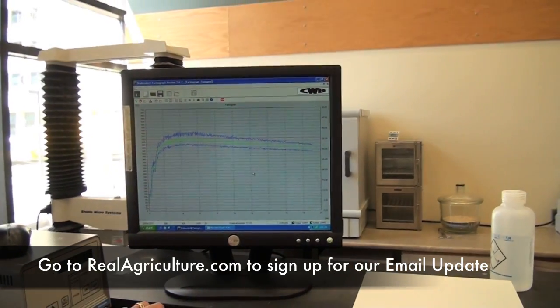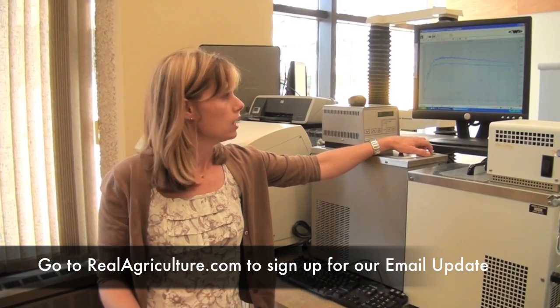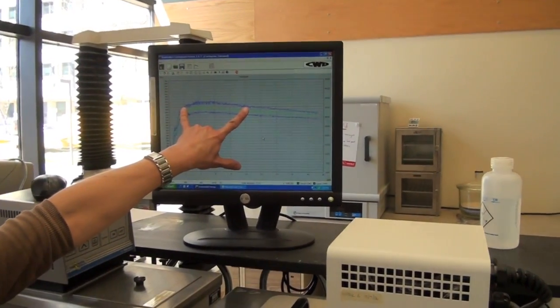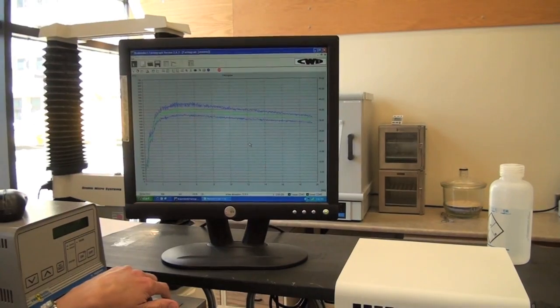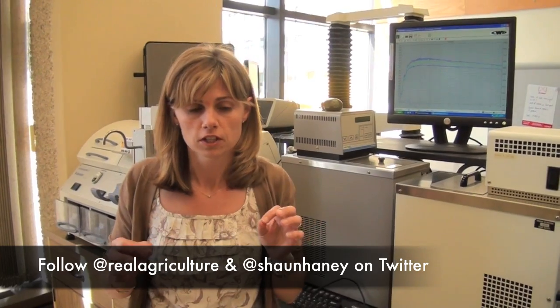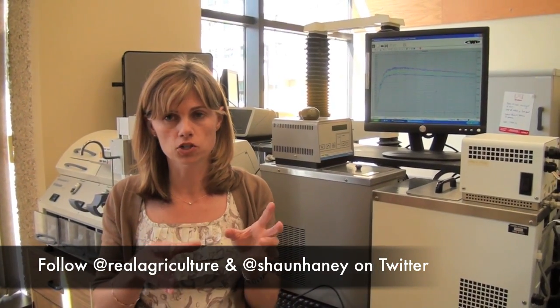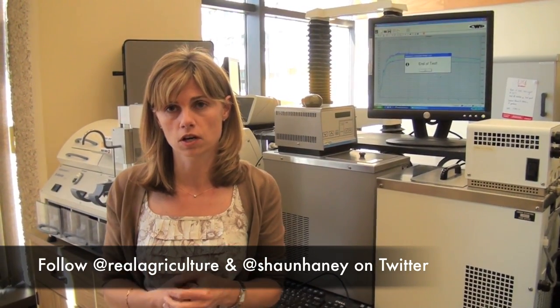Why is that important? The mixing tolerance index tells you the rate of breakdown — a low number equals a low rate of breakdown. The stability measurement is important because it tells you how stable a dough is to mixing. We like to see the top line stay above the red line for an extended period of time, indicating the dough is stable to extended periods of mixing — it has endurance and strength. Stability is probably the most important parameter people ask about, because in a commercial bakery going from mixing to sliced bread, they can't change individual times to accommodate dough with different strength characteristics. If a dough has stability, it's very versatile and can be used without much changing to their setup.